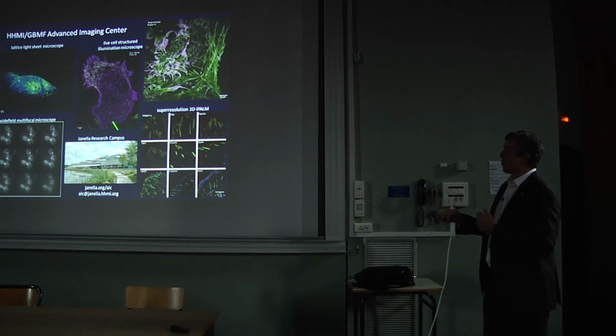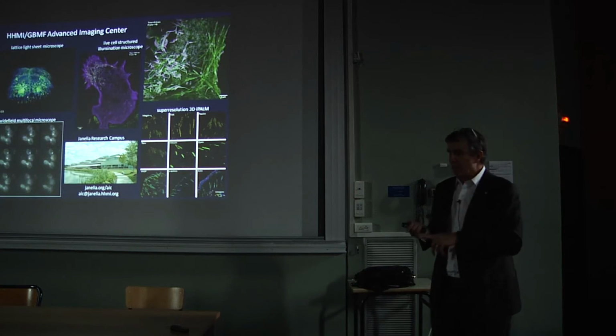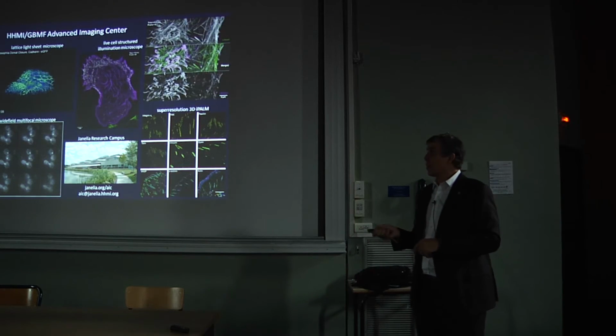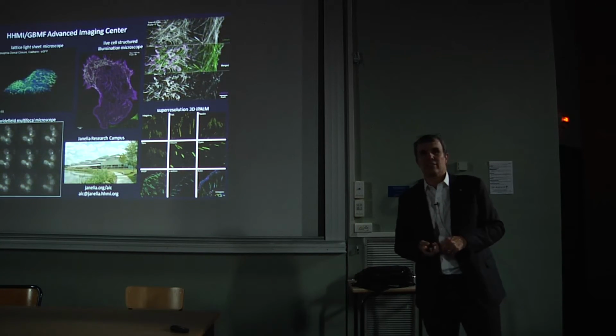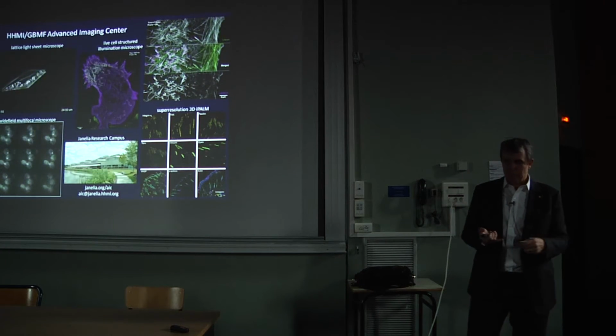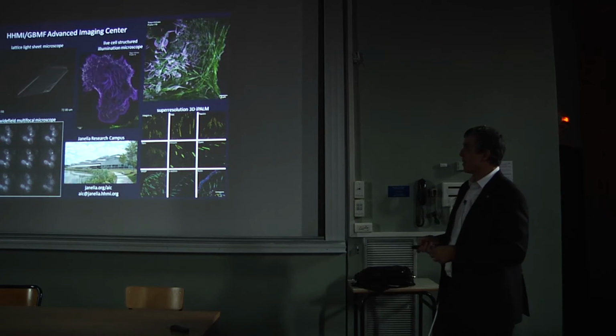But what we've done to try to get these tools in the hands of biologists is, first off, we've created an advanced imaging center where people can come, and we have clones of all of these instruments that I've described for biologists to use. And they come for usually a week or two at a time. They go away always with lots of data.